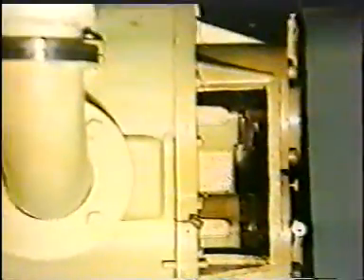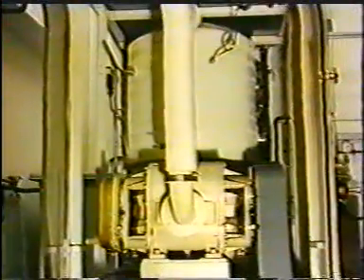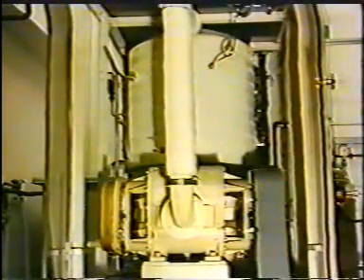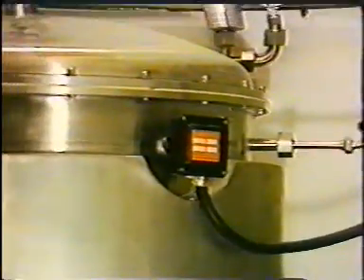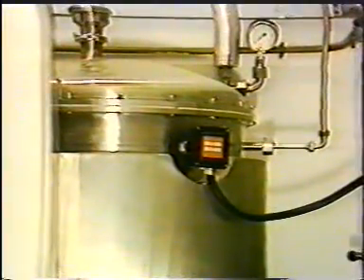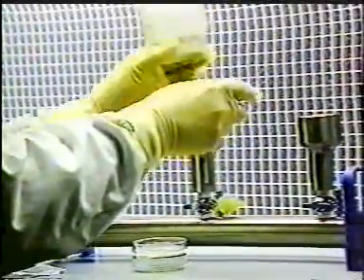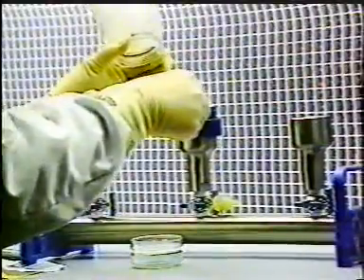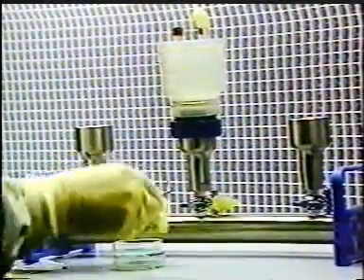One very special raw material which is generated in the production unit itself is distilled water. This may be collected for use directly from the still, or it may pass to a storage tank, which in turn may be part of a ring main system. Samples of distilled water are tested at regular intervals in the quality control laboratory, both for chemical impurities and for the presence of microorganisms.